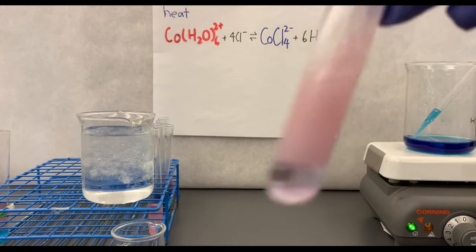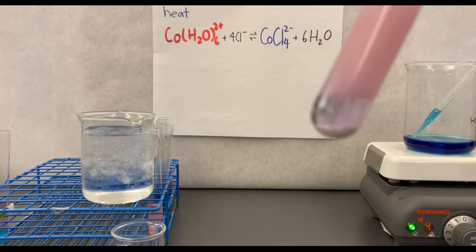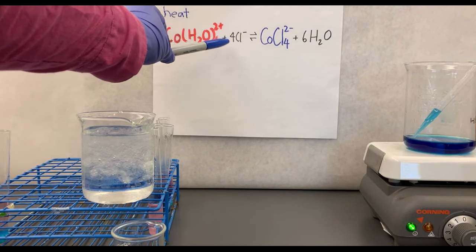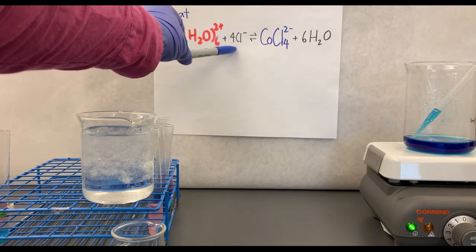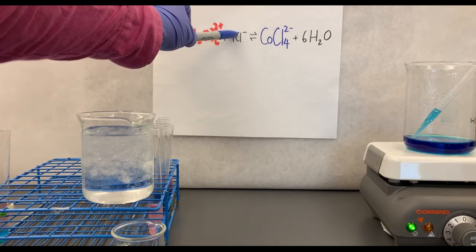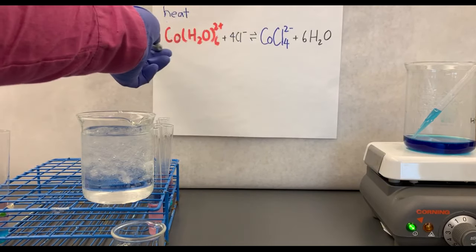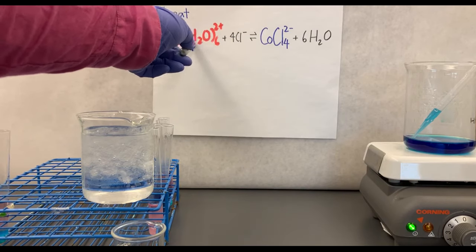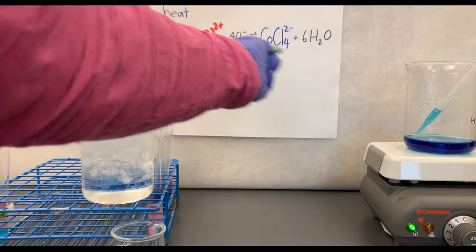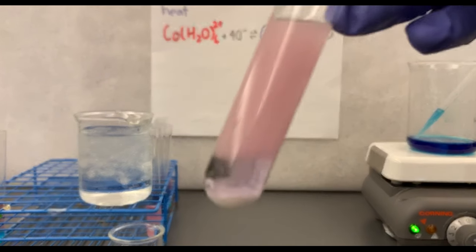When it forms a precipitate, what you're actually doing is removing the Cl from the solution because it's now a precipitate, right? So really when you're adding silver nitrate, silver Ag plus grabs the Cl to form AgCl. It forms a precipitate, so you're basically removing Cl from the solution. If you're removing a reactant, you're shifting the equilibrium to the left, okay? So before it was some of this, that's why it was purple before. And as you remove Cl, you're shifting it to the left until it's forming all of this. That's why after I added it, it looks like a pink color, right?